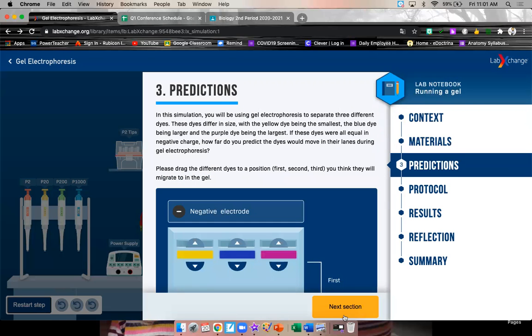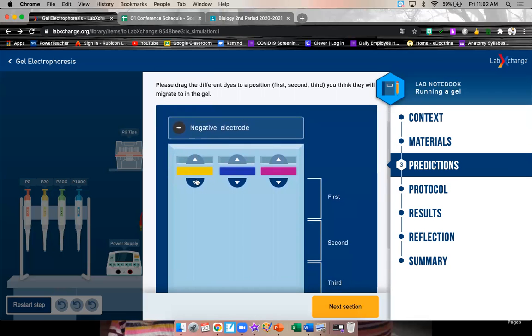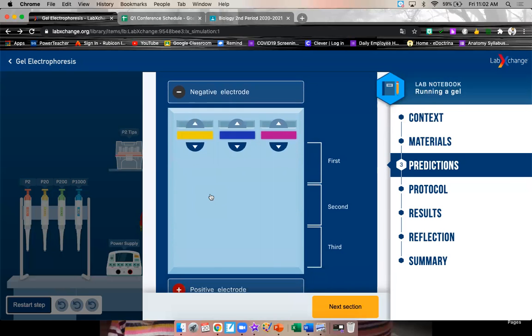So predictions. In this simulation, you will be using gel electrophoresis to separate three different dyes. These dyes differ in size, with the yellow dye being the smallest, the blue dye being larger, and the purple dye being the largest. If these dyes were all equal in negative charge, how far do you predict the dyes would move in their lanes during gel electrophoresis? I am not going to do this for you. At this point, you are going to do your own prediction. So first, second, third. Remember that yellow is the smallest one.